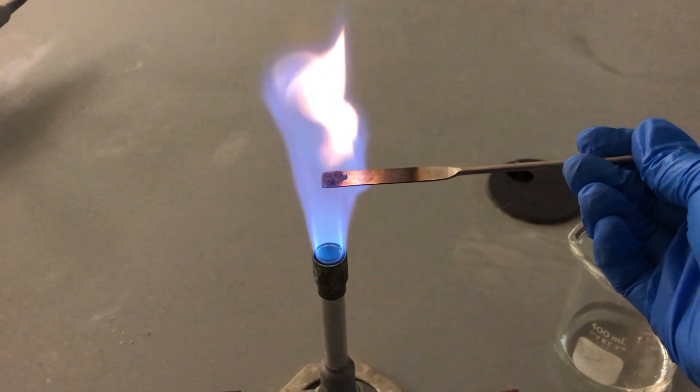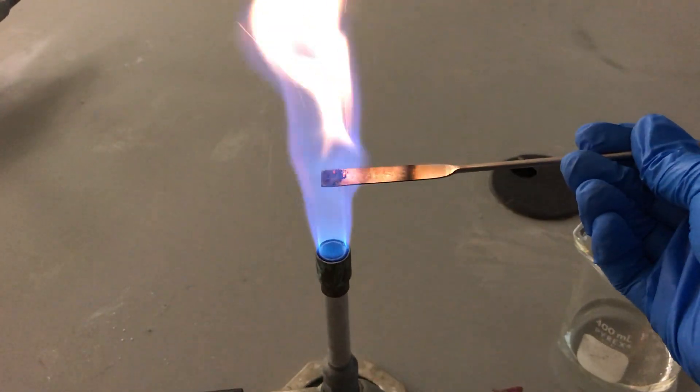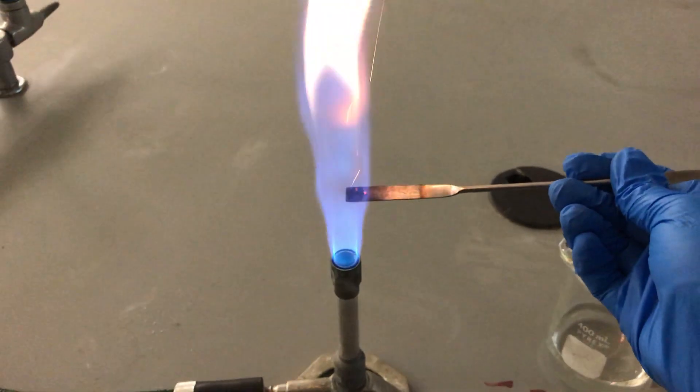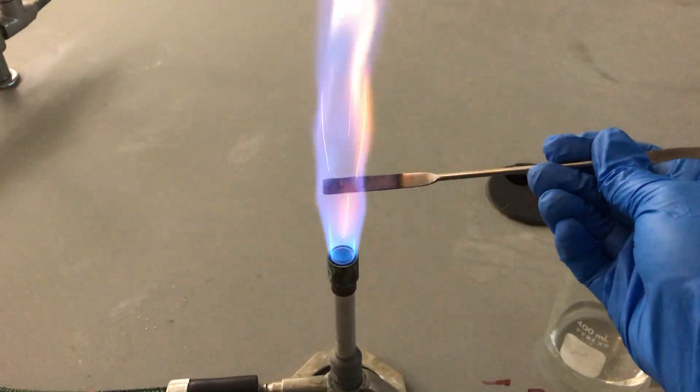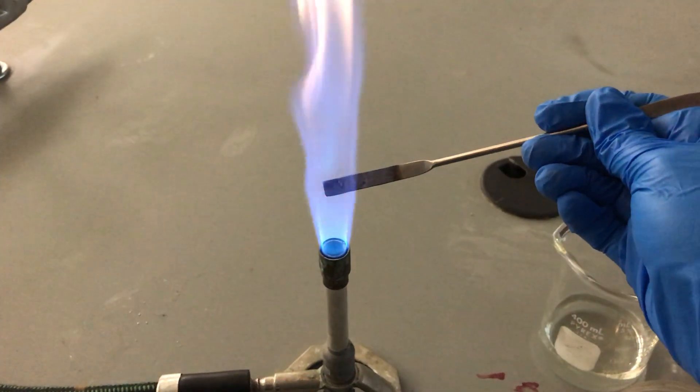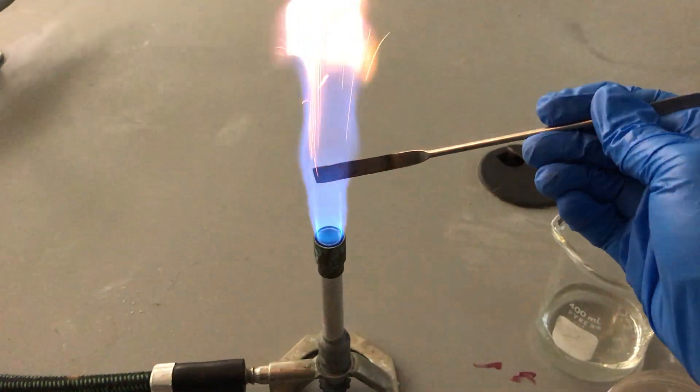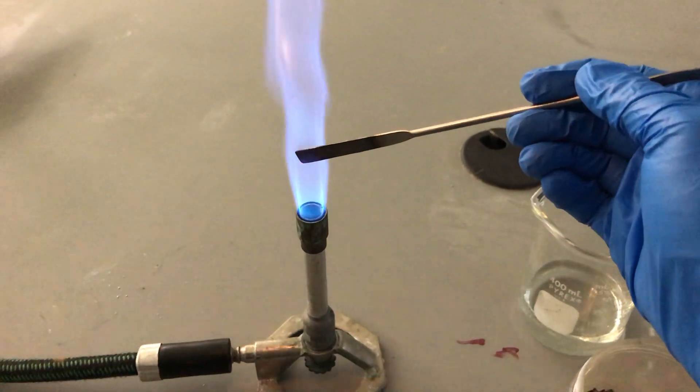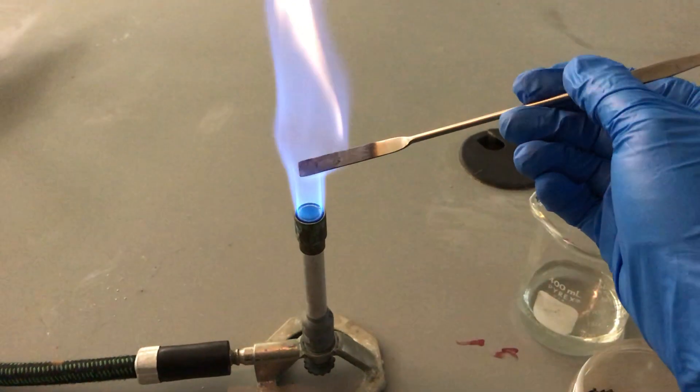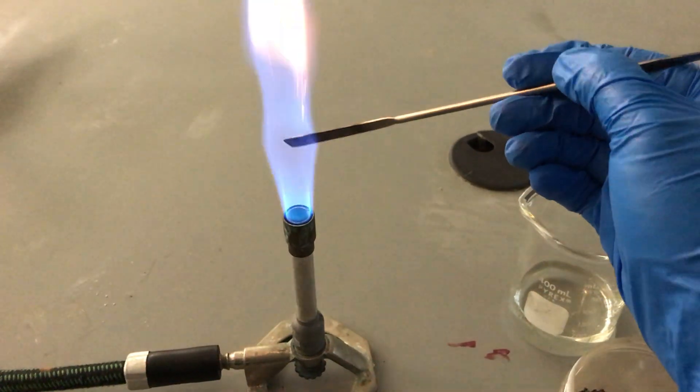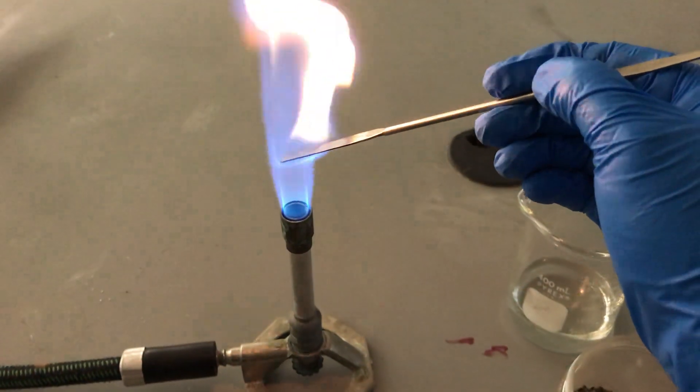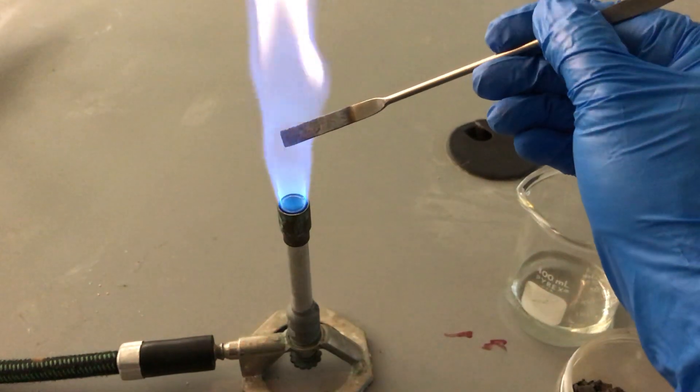Once we do that we are going to introduce it to the flame. And if you look at it closely you can see the flame itself is kind of an orange color and there's lots and lots of sparkles coming off of our sample. And orange and sparkles indicate, well, I'll let you decide that when you look at our soil key.